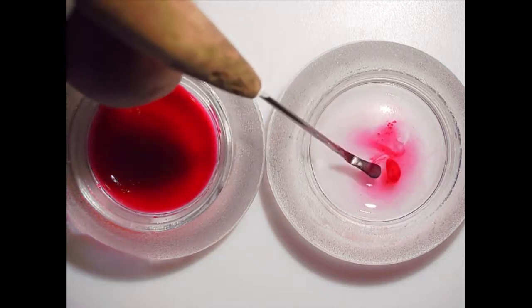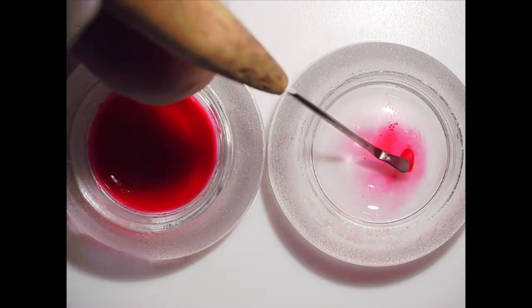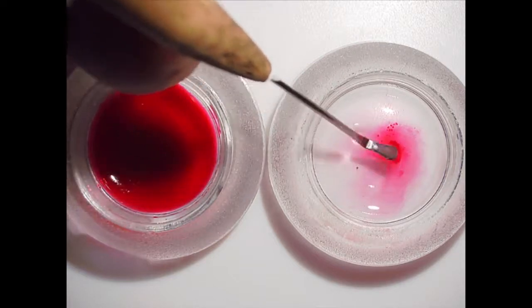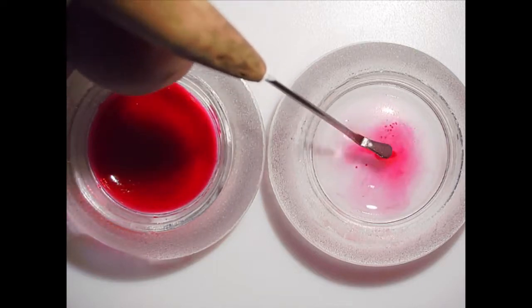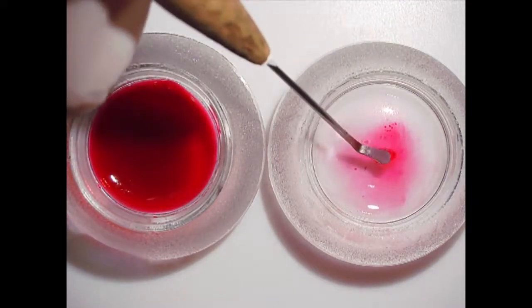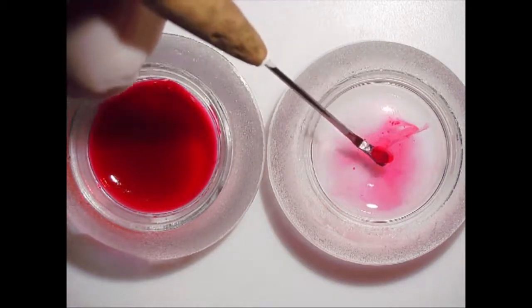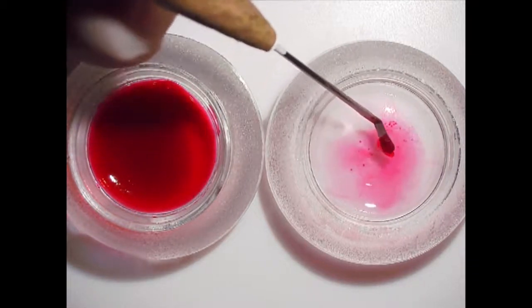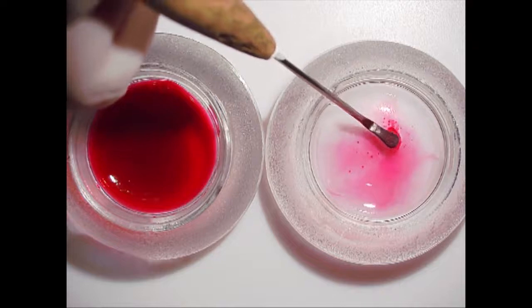And moving the specimen again on the bottom of the dish, moving it around. The extra stain is coming out here. You don't want to keep it in the alcohol too long. First, the alcohol could evaporate, and then you're left with a specimen stuck to the dish. If that's the case, you can put more alcohol in. And I'm using pumping action again, using the surface tension to flush out the insides.